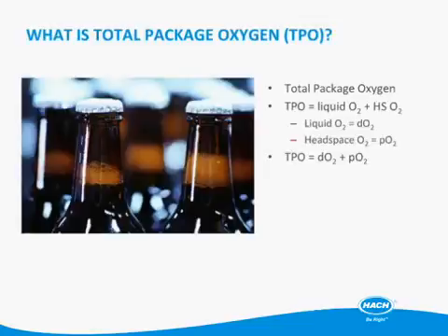And if you give that beer enough time, in fact, in some cases of some types of packages, it's only days, there will be no O2 left in that package. So it's really important to look at the total package oxygen content of a beer.